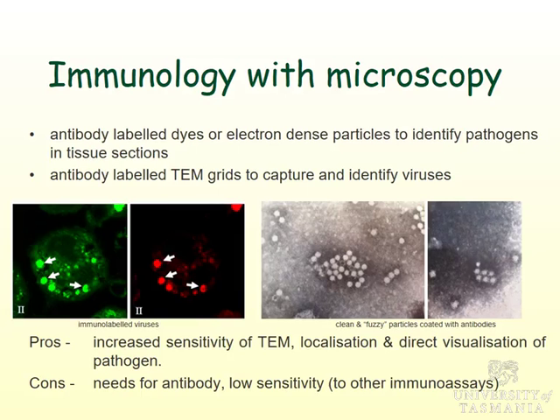There we go. We've got things that might have been viruses, but everything else was sort of going green. But we added this antibody with a red fluorophore on it, and then we put it under a different light system, and oh, these are glowing red. These are our virus, and that's exactly where they are. Rather than, here's some blobby things that might or might not be, we're not quite sure.